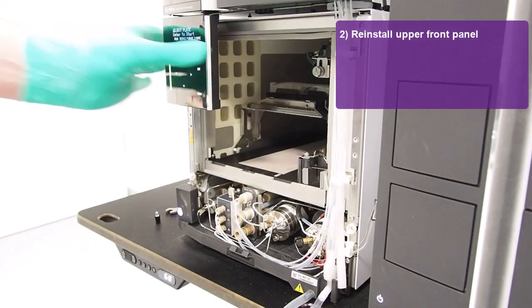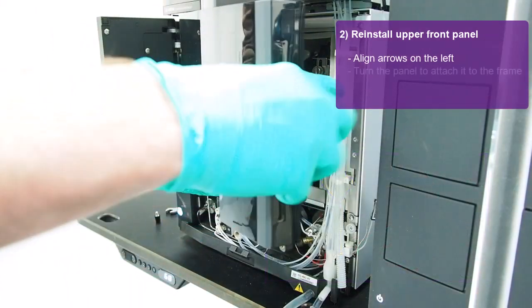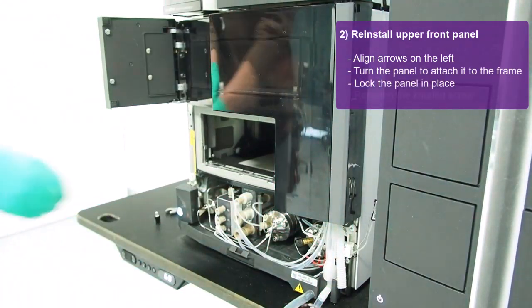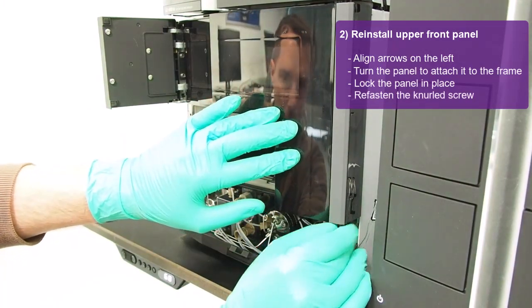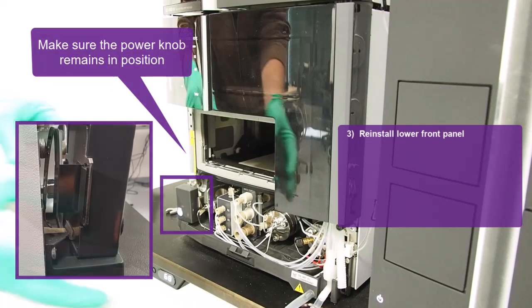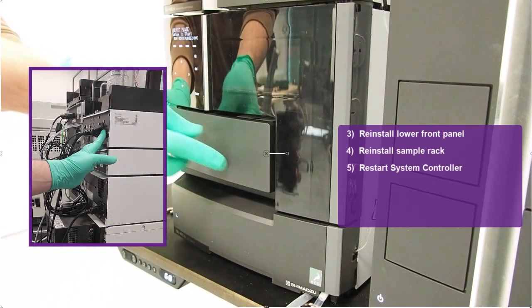Check that the catch retracts upwards when the lever of the rack panel is pulled. Now reinstall the upper front panel. Make sure you align the yellow labels on the left as shown. Turn the panel to attach it to the frame on the right and firmly lock it in place. Do not forget to refasten the knurled screw. Place back the lower front panel and be careful the power knob remains in position. Now install the sample rack again, and restart the system controller on the back.